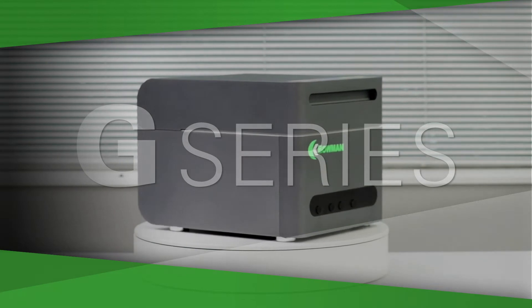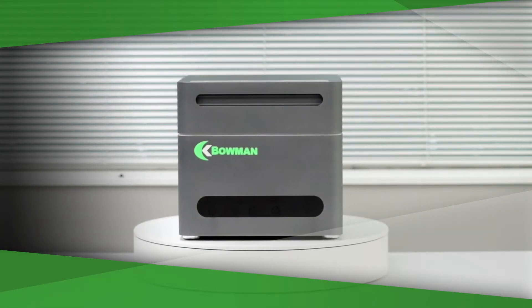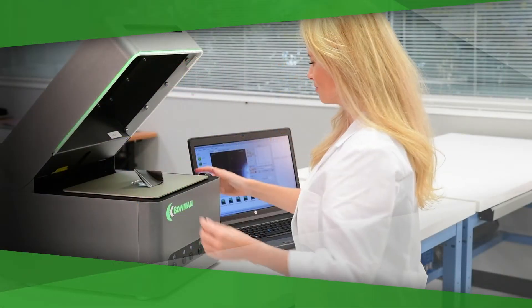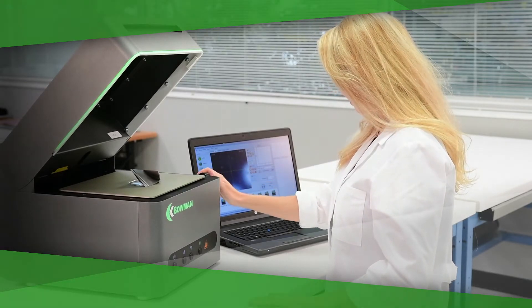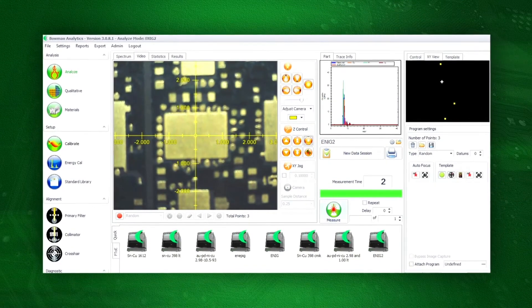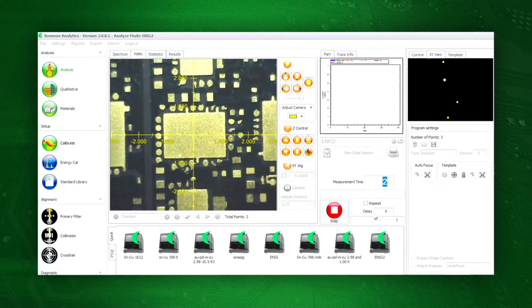Bowman's G-Series XRF has two features that make it distinctive: video imaging, which provides the highest precision in the positioning of small parts, and a unique bottom-up measurement system with a motorized z-axis and laser-based autofocus. Bowman's autofocus feature automatically focuses on the sample and generates an optical image in seconds. No manual adjustments are ever needed.